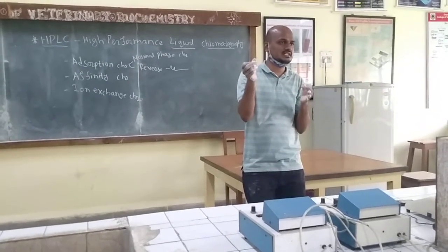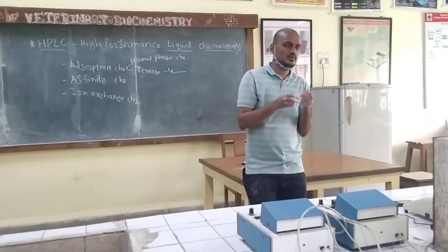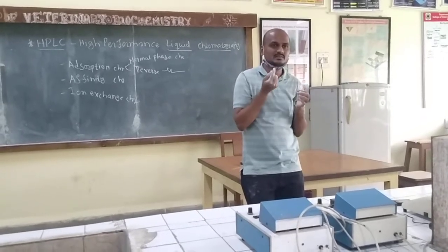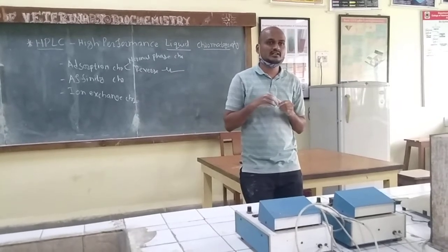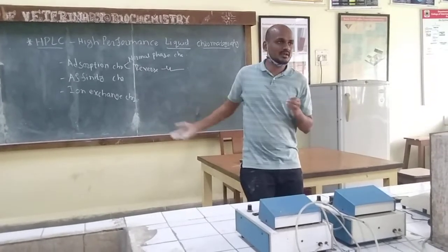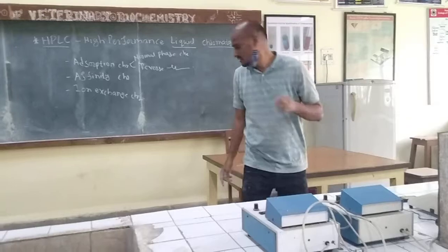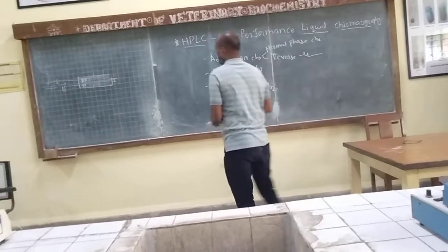So for example, you consider it as affinity chromatography based. Or if it is a protein based purification, in a protein column also there are antibodies attached to this column, and then we can separate a very specific molecule. Out of 10,000, for example, you want only A molecule. You can detect 10,000 with UV, for example, but you want to separate only A. So you will not prepare 10,000 tubes and take 10,000 readings. You only want a single one. So in this column, the aim is to detect only the A molecule.